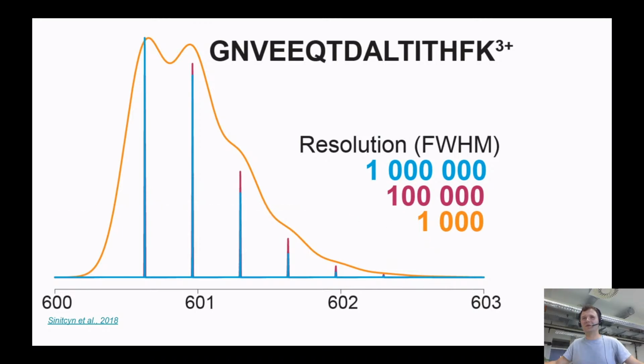This is especially true, for example, for sulfur. In the case of sulfur, one of the isotopes is very abundant, something like 5%. As a result, at high resolution we can really see that each peptide with sulfur in its content splits in two. It's actually very useful. But we see that at the low resolution of 1,000, which is not used anymore, we cannot distinguish different isotopes.